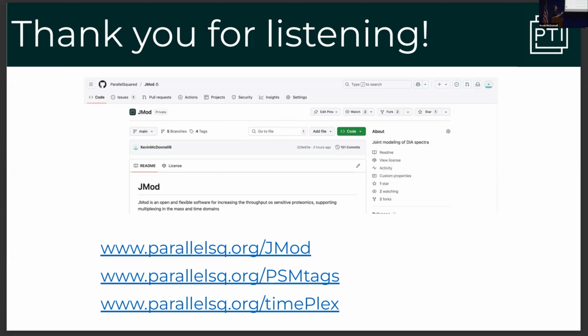I guess Nathan, who works with us, has talked about this, and I think it was done maybe in the Spectre paper too: you could do an identification run where you just fit both targets and decoys together, and then for MS2 quantitation, remove the decoys and just fit those high-scoring targets to get better quantitation. But for the identification, we just fit them all simultaneously. And so if decoys are attributed signal, it should be at the same rate as your false positives, ideally.